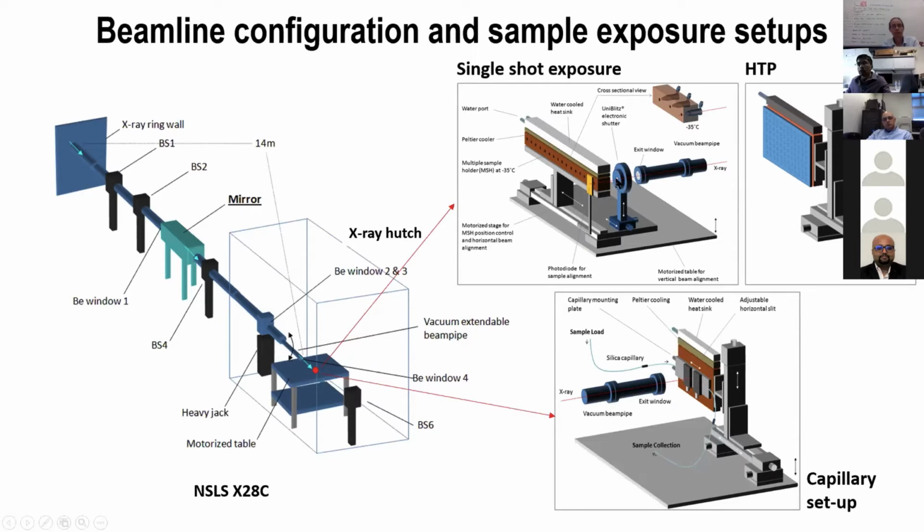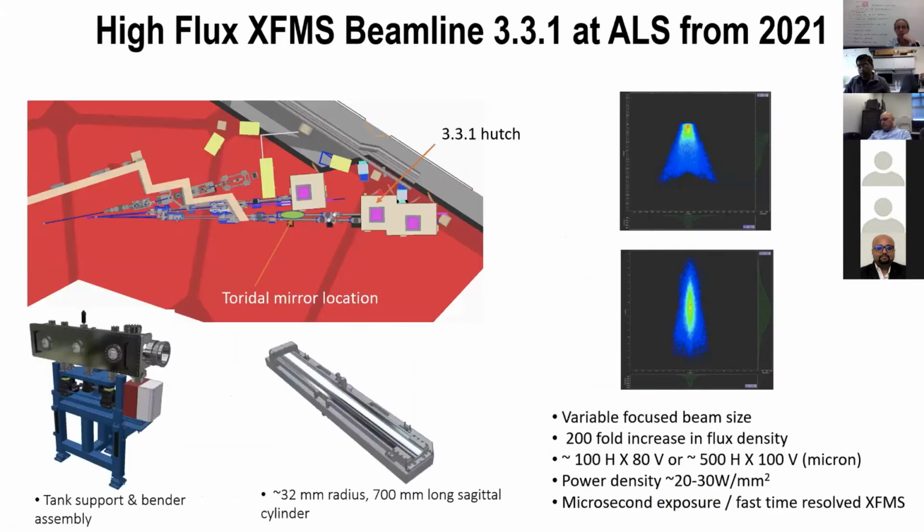We used to go down to 10 milliseconds. But this is flow dependent. You can move as fast as possible and then get a very short exposure time. So there's a certain advantage of the capillary setup.